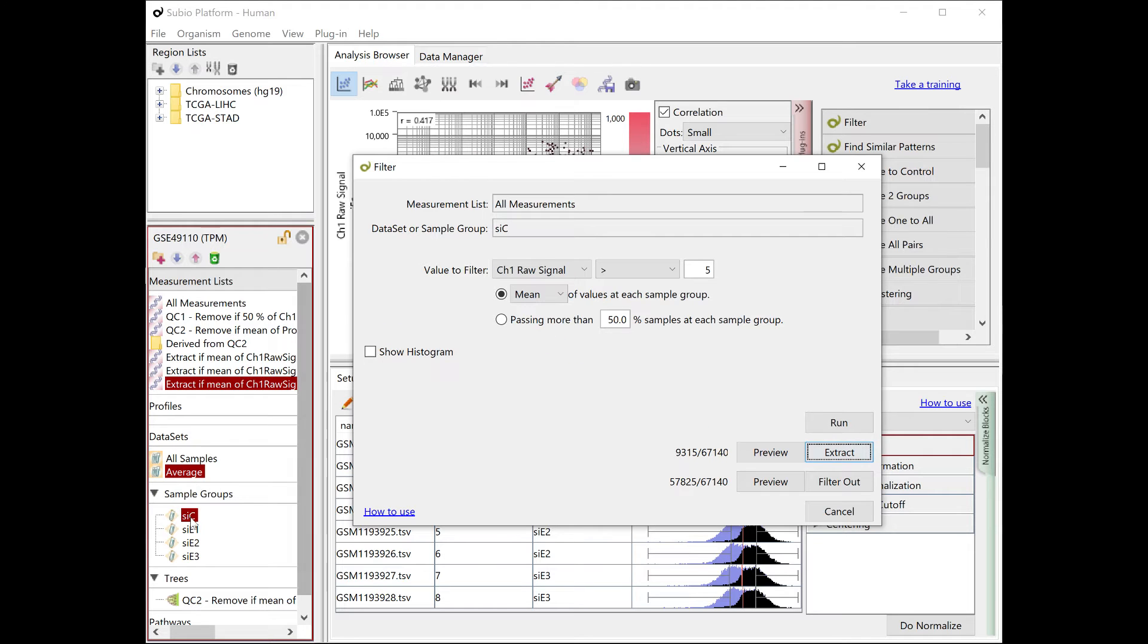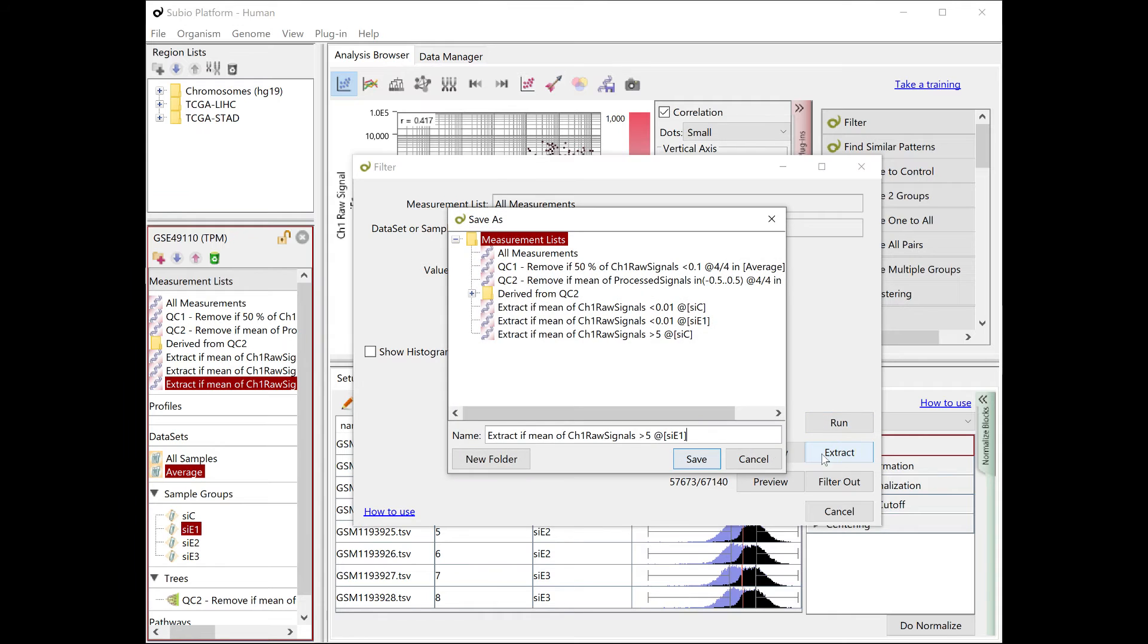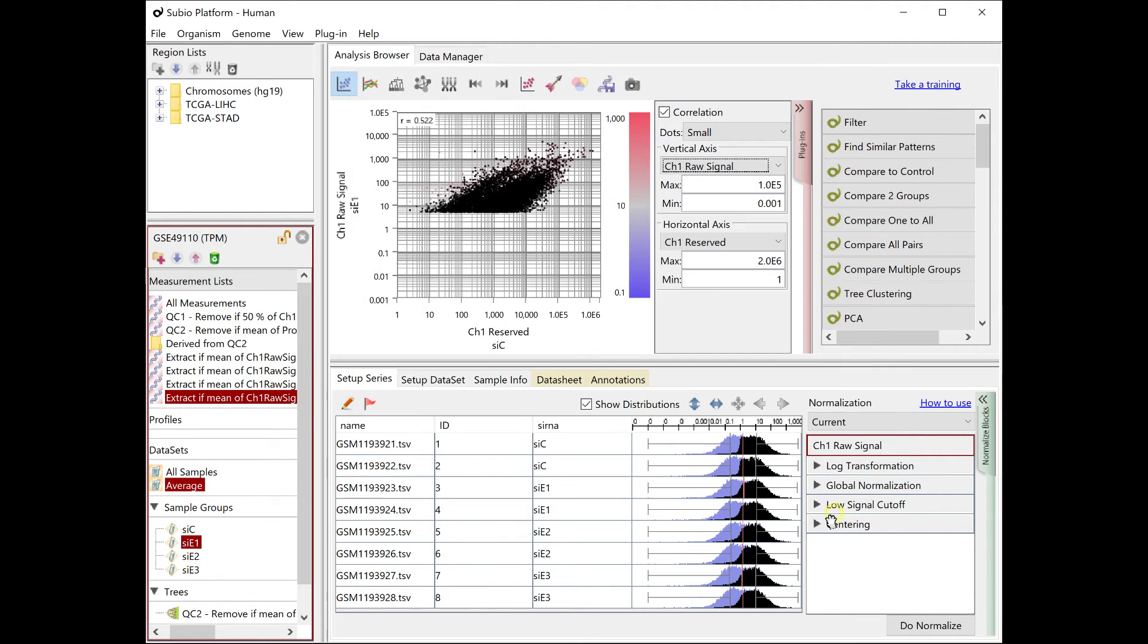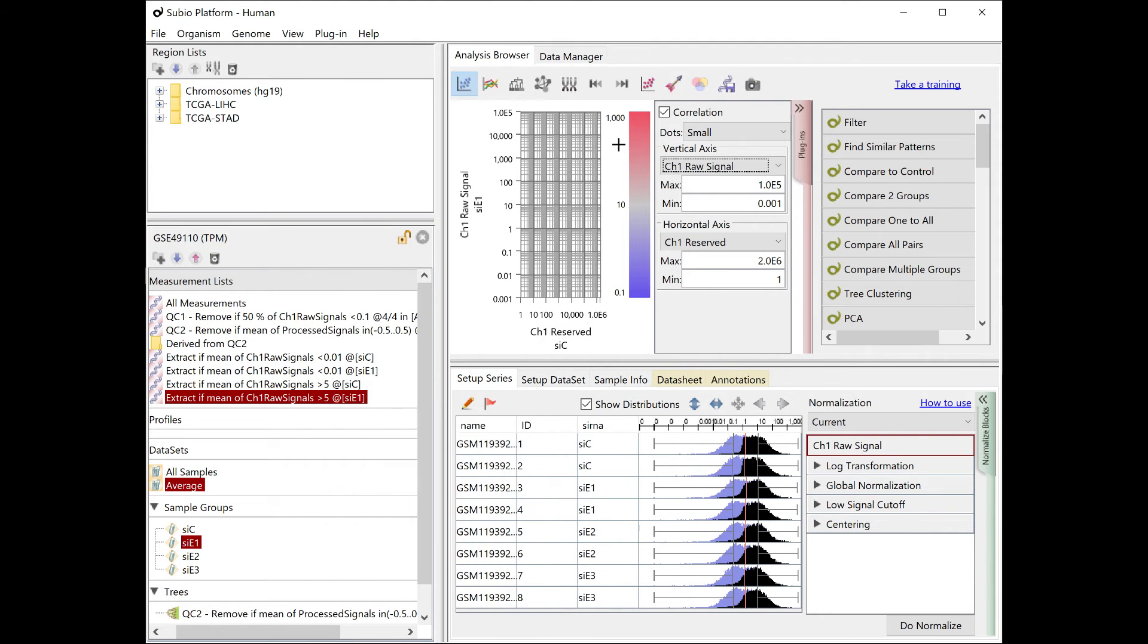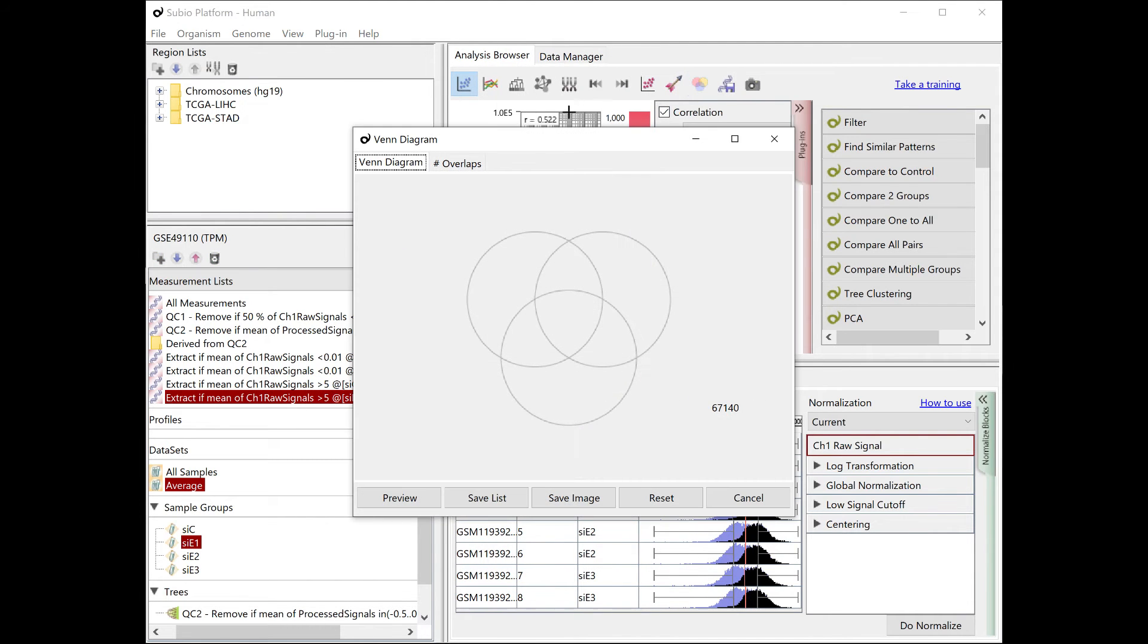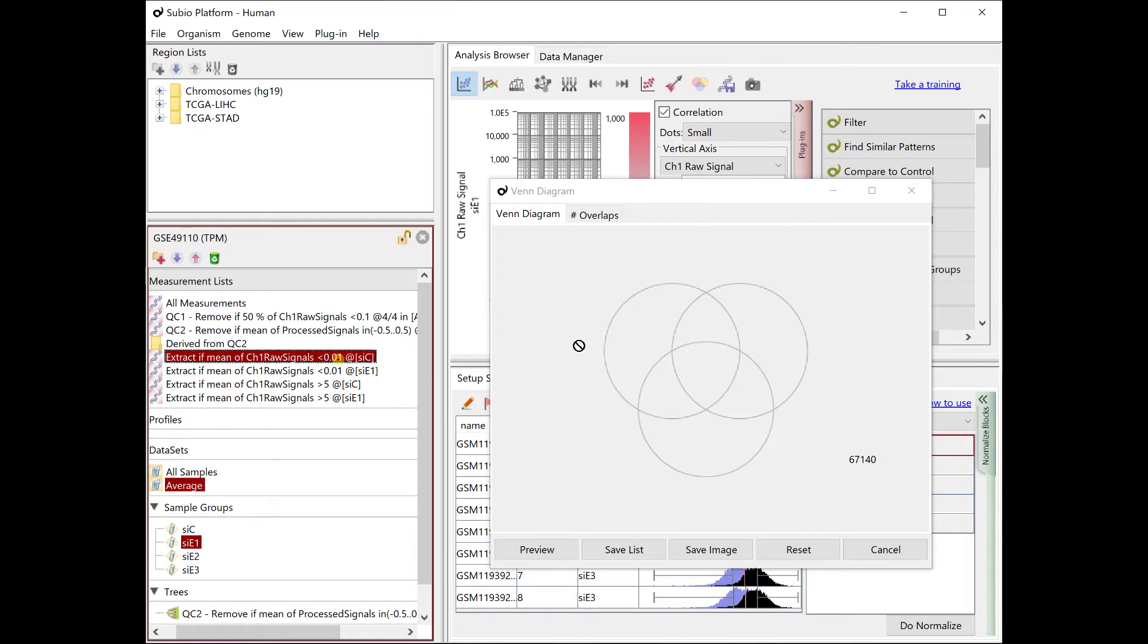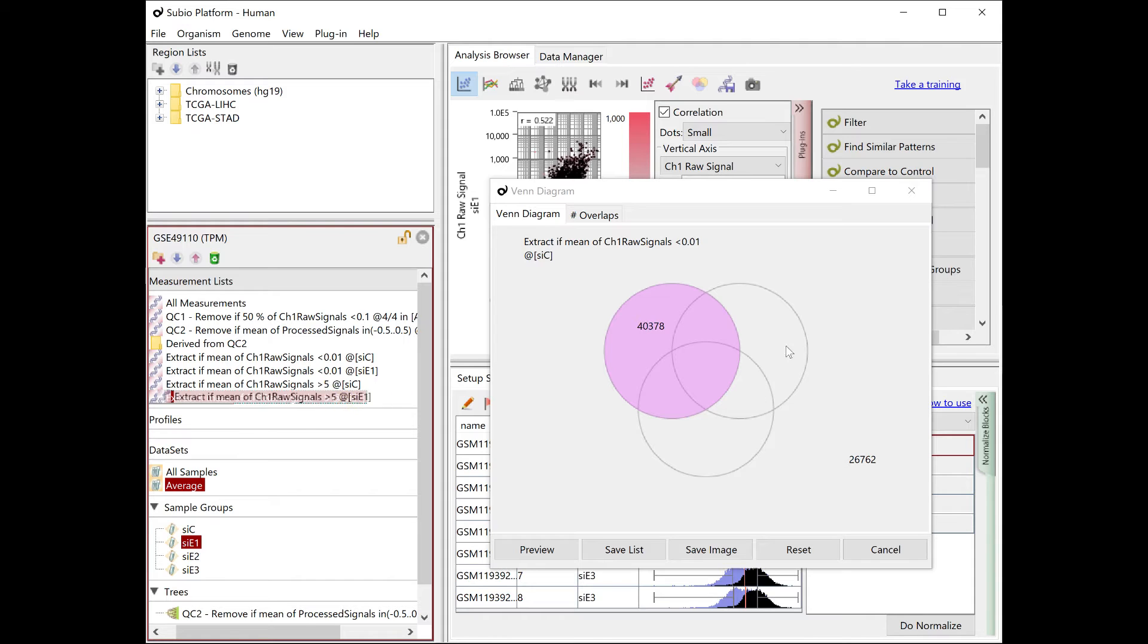Similarly, make a list of genes that are likely to be expressed at CE1. Now that we have four lists, we can combine them with the Venn Diagram tool. Make a list of genes at the intersection of not expressed at CC and expressed at CE1.